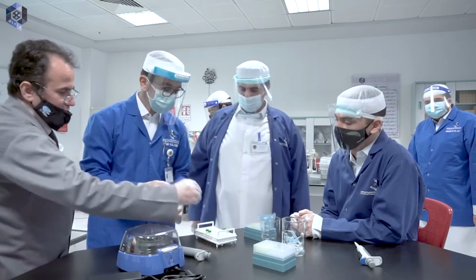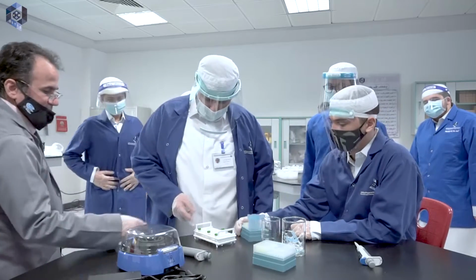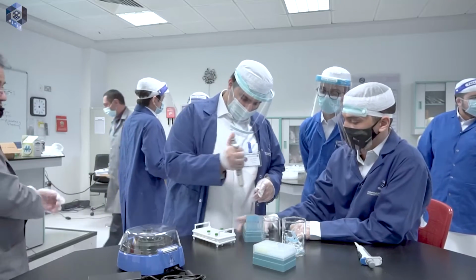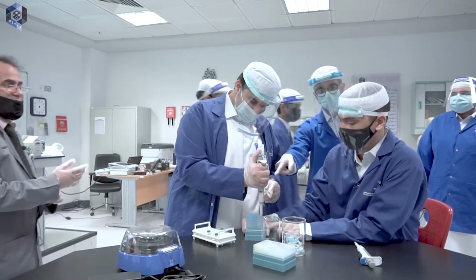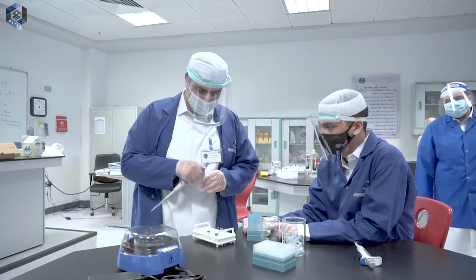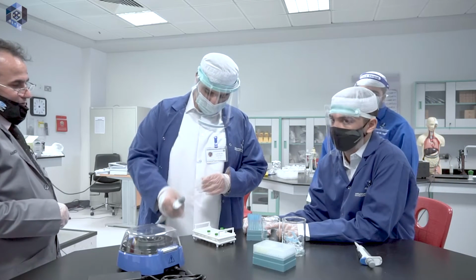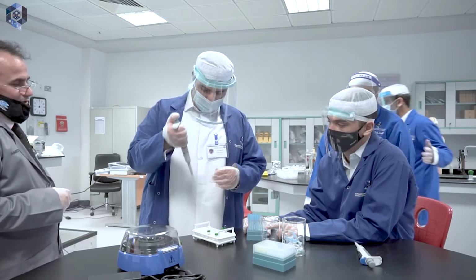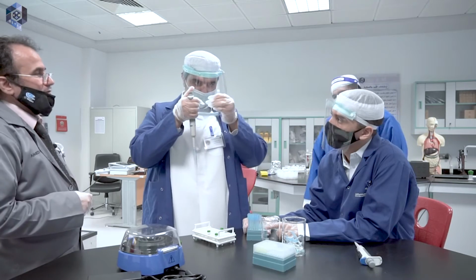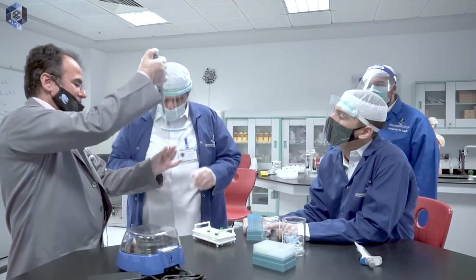Next. Go sterilize the bench there. Take from the upper layer, like this.